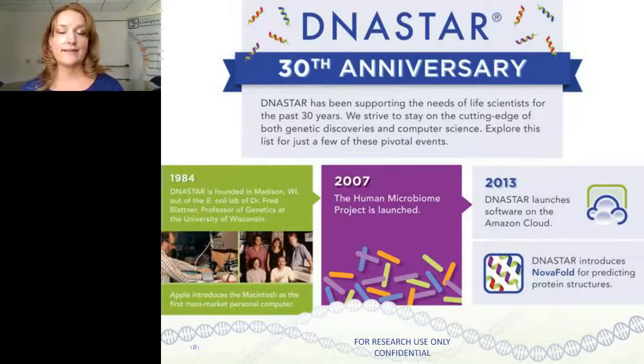Now, back in 1984, it was quite an accomplishment to be able to run powerful genetic software on a desktop computer. But for 30 years, that's what we've been doing, and we've been continuing the tradition of providing powerful software on accessible and affordable hardware.